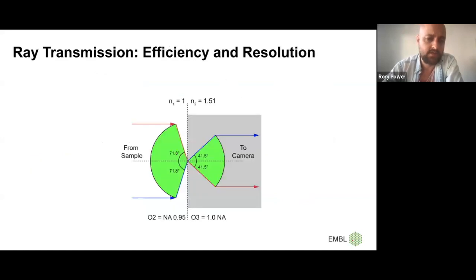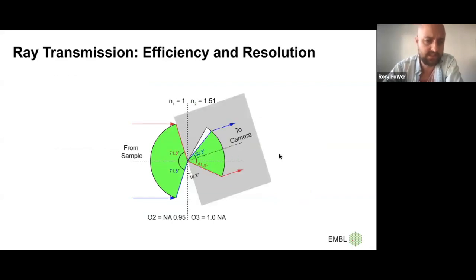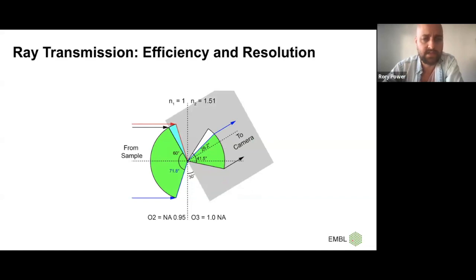So again, just showing this, if we use this glass-tipped objective in the remote focus arrangement, we compress the rays over a smaller range. We can tilt the system all the way up to about 18 degrees, I think, without losing any rays in the system. So in that case, no loss of resolution or light throughput other than reflection and absorption. But you do need to sacrifice some aperture to your light sheet generation. Something like 25 to 30 degrees of tilt is generally considered a reasonable compromise. This gives you minimal loss of rays, so the black ray is still the limiting one. As we'll see, this is fairly negligible in terms of losses. And you get enough aperture for your light sheet generation to produce a suitably thin and long light sheet for what you want to image at this scale.